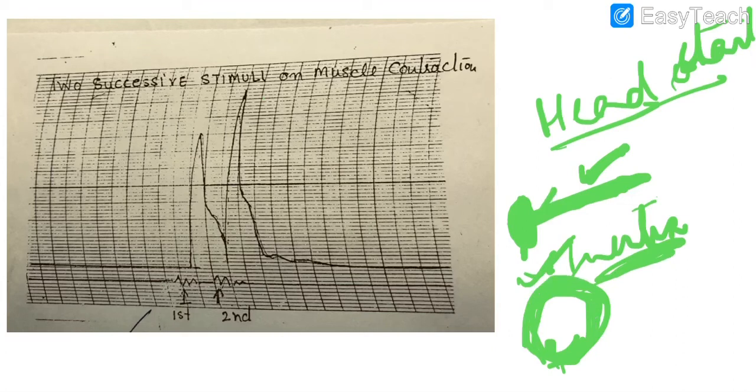Now you have already completed the first round, so there is an increase in the temperature, body temperature, like the temperature if we talk about the contracting muscle. So if the temperature of the contracting muscle has increased, there is reduction in the viscosity and there is a little bit increase in the metabolic activity.